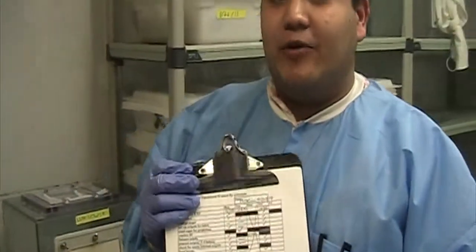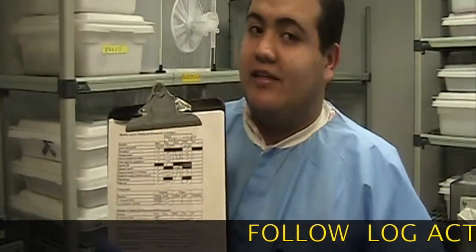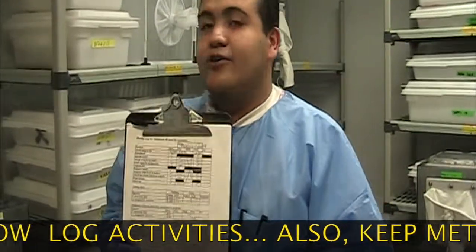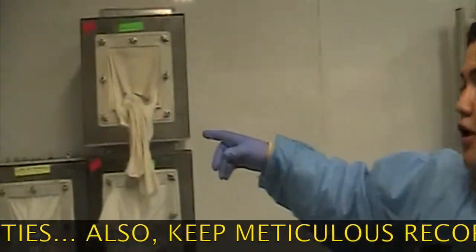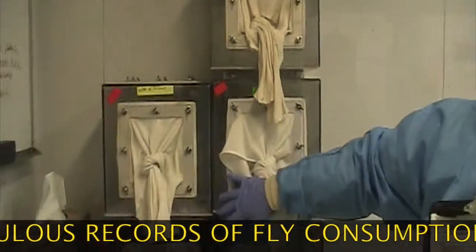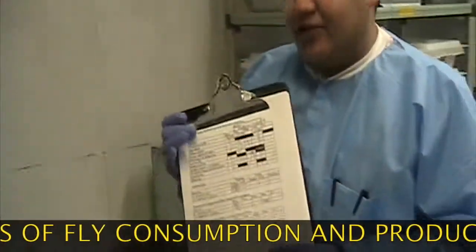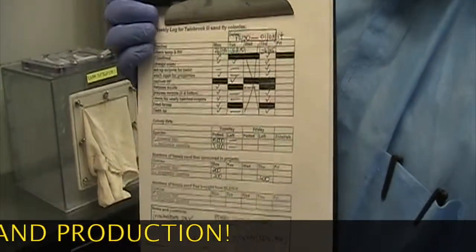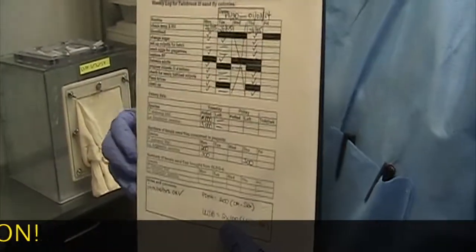The next step I want to show you is our log book. This is where we keep track of what we do. One of the activities we do is blood-feed the colony — we blood-feed them twice a week. You can tell which cages have been blood-fed because we keep red tape on those cages. Here's a close look at the log: we give sugar water every day, Monday through Friday, so the flies have a good source of food.